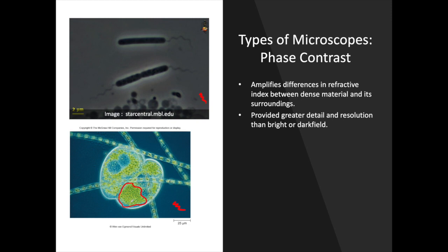We get a much darker color. But up here, where we have what's known as a central vacuole, we can see there's very little in there because central vacuoles store water and nutrients. There are no chloroplasts in here, no chlorophyll or anything like that. It's less dense, so the light can reflect off of it differently.